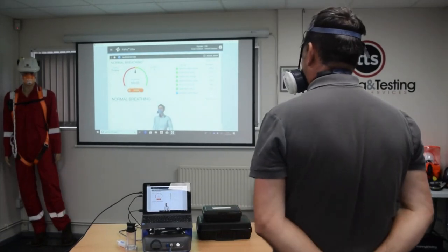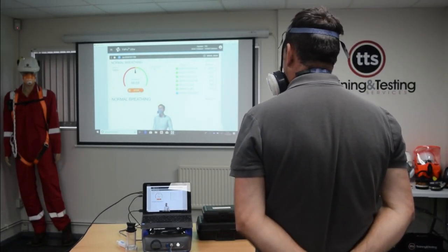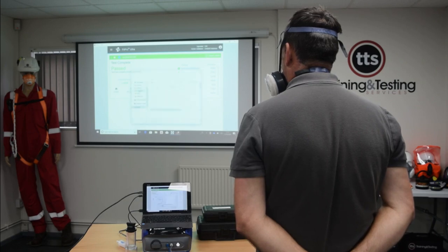Okay, so that's the test now complete. I'm just waiting for the machine to finish off its final calculation to give us the average fit factor. That's again a good pass. This time the overall fit factor is just over 11,500.